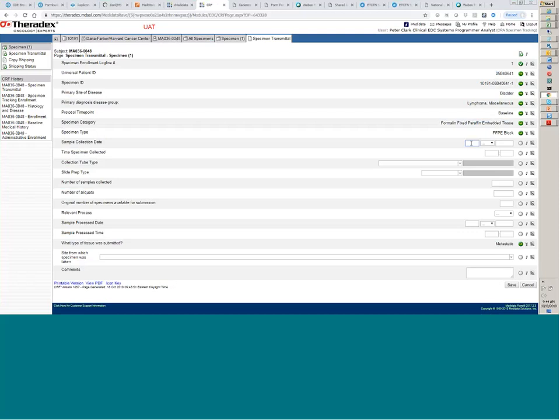So now we can enter the date, and let's suppose that this was collected today. So we'll put in the 18th of October, 2018, and maybe it's at 10 o'clock this morning.